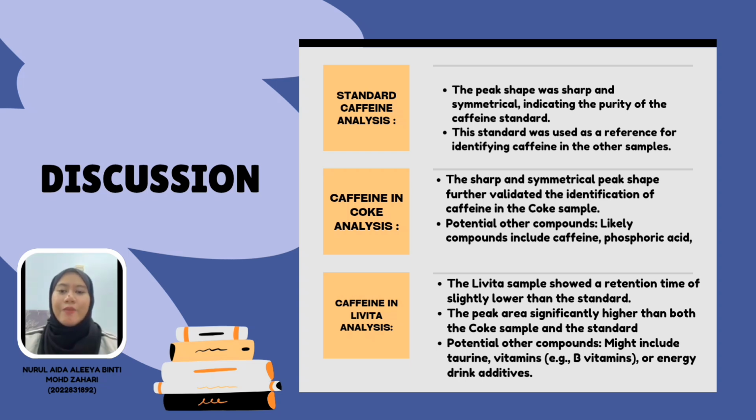The Levita sample retention time was slightly lower than the standard retention time but close enough to confirm the presence of caffeine. The peak area was significantly higher than both the standard and the Coke sample, indicating a much higher caffeine content. The peak height further supports the conclusion of Levita containing the highest caffeine concentration among the three samples. The sharp and symmetrical peak shape confirms the purity of caffeine in this sample.